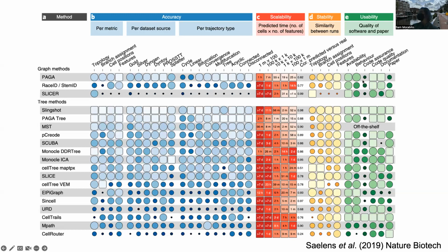I think back then that was true, because PAGA is part of ScanPy, and I think that package has come a long way in terms of documentation. In 2018, 2019, it was brand new, and I think it was one guy working on it. So nowadays, PAGA would probably be good for all of these. The paper is really short though, but there is a paper.